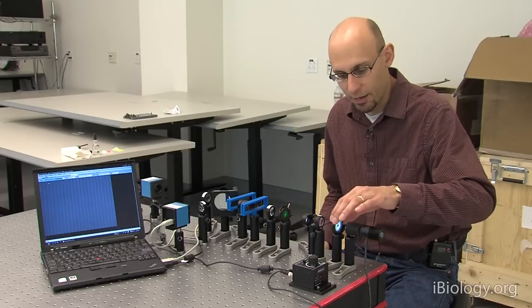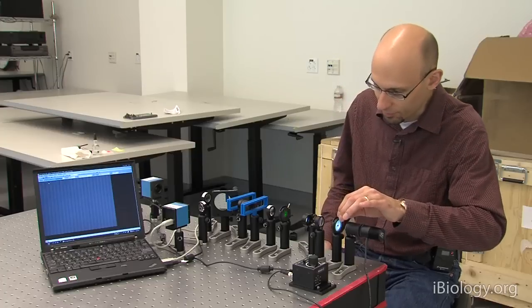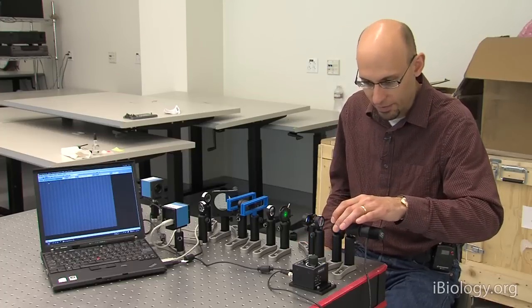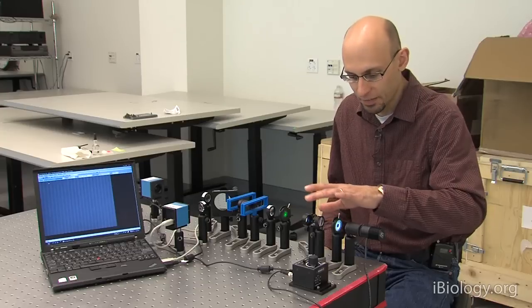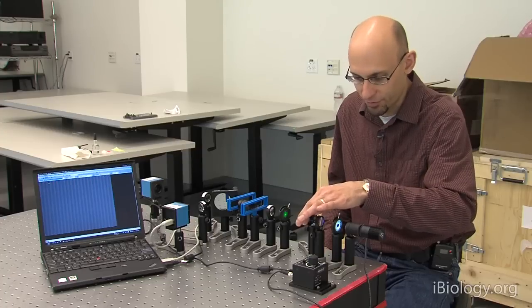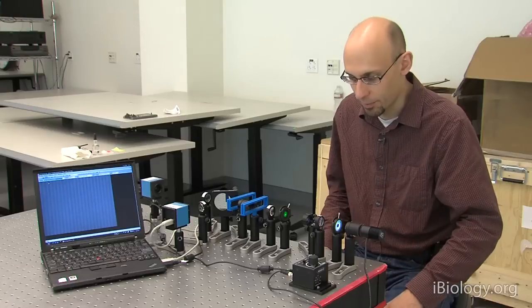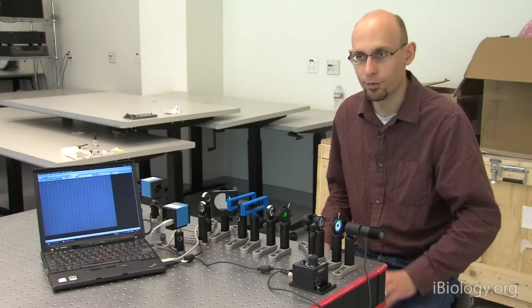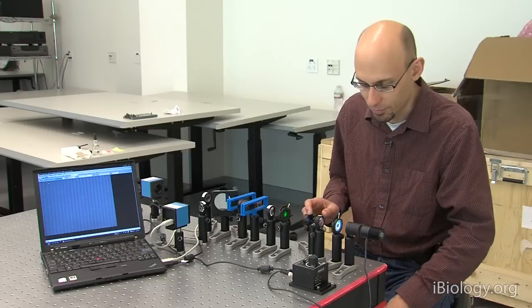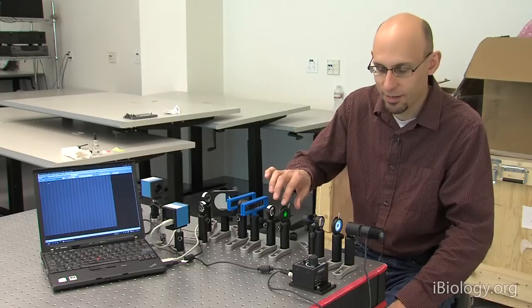Starting with the object closest to the LED, this is our field iris. So opening and closing this iris controls the region illuminated on our sample. Then we've got our field lens. This is a color filter, so this is just a green filter I can put in to get green monochromatic light to my sample, and we'll mostly be using that to avoid issues of different colors having different behavior in this microscope. This here is my aperture diaphragm, my condenser diaphragm.